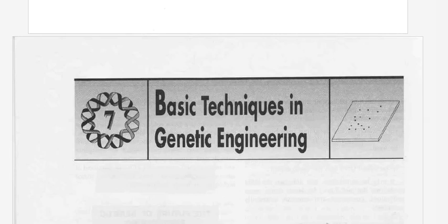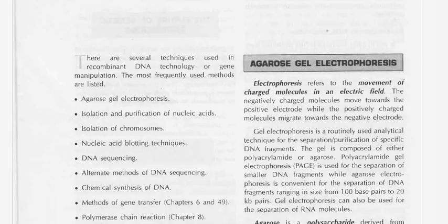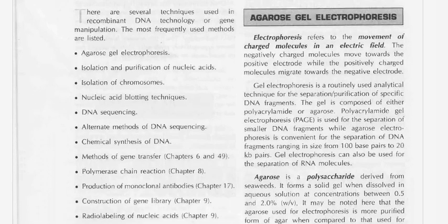Guys, we will discuss some basic techniques in genetic engineering. So what are the basic techniques which are utilized in genetic engineering? These are agarose gel electrophoresis. Then there are others.